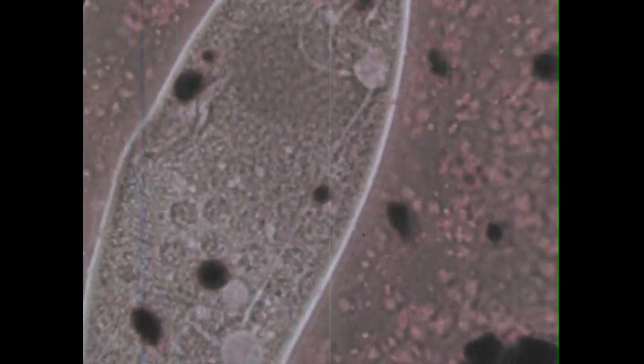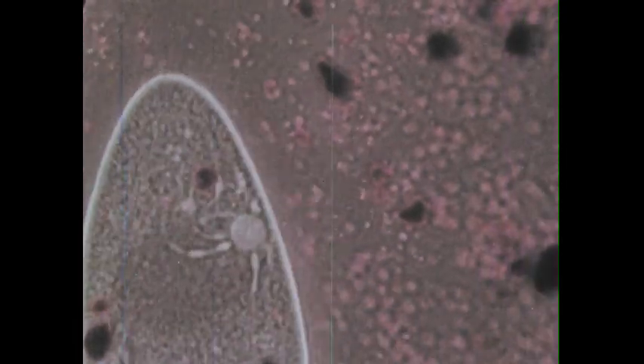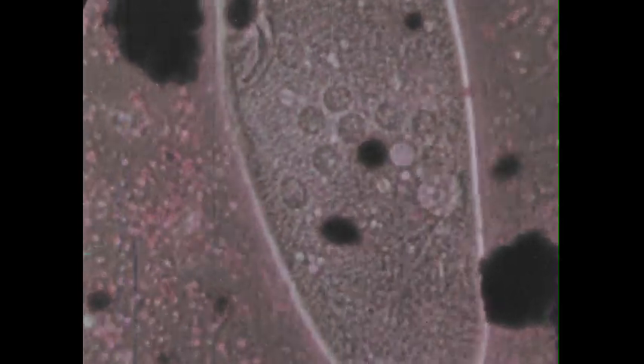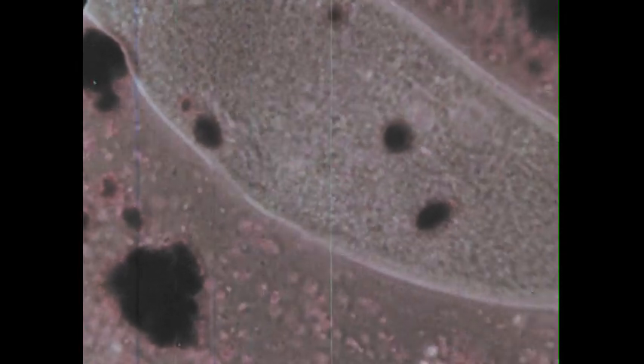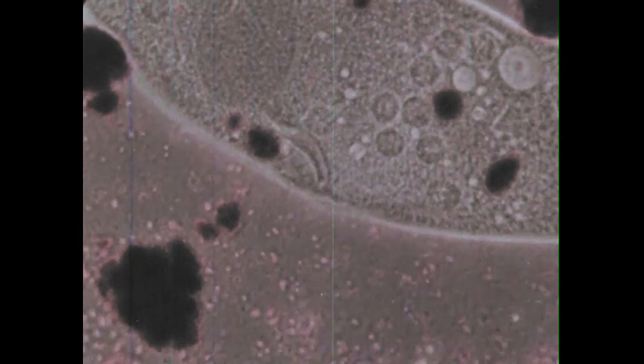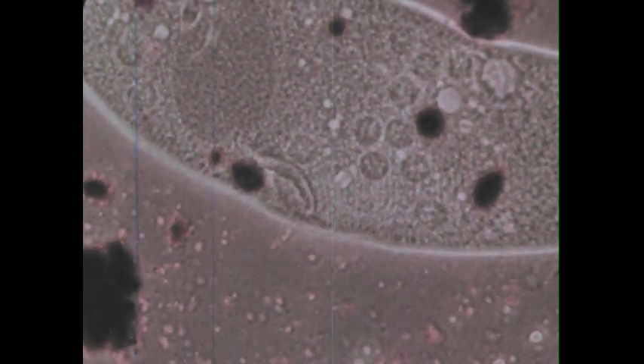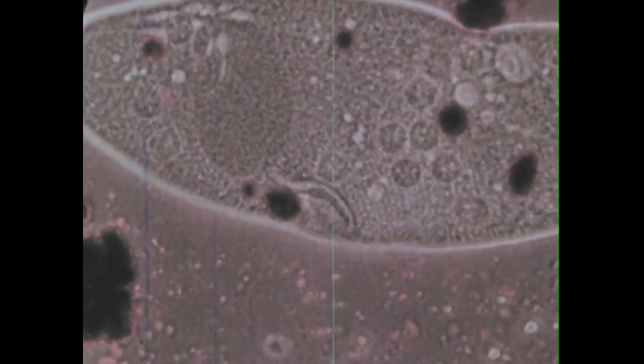Now look at its shape. Can you see if the outside is stiff and rigid or whether it's flexible? Let's take a closer look. Now with some red particles in the water, watch here as it squeezes past one clump of these. Do you see how the cell wall is dented in? Here's the nucleus — that's easy to find. Here's something else very interesting: this curved indented part of the Paramecium seems to be sweeping particles into the inside of the cell. You can see how the red particles in the water have been swept into the cell and gathered together in clumps in what we call food vacuoles.